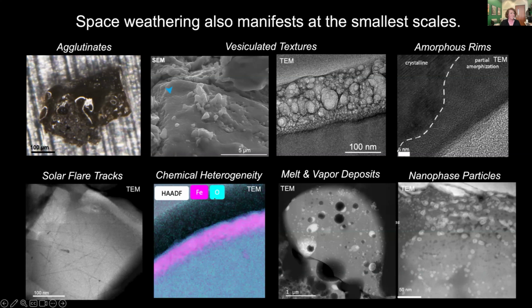in the crystal structure. We also have more energetic particles that form bullet holes or tracks through the crystal structure of the grain. You can see them tracing them here in this transmission electron microscope image.